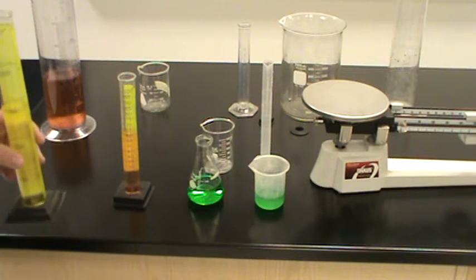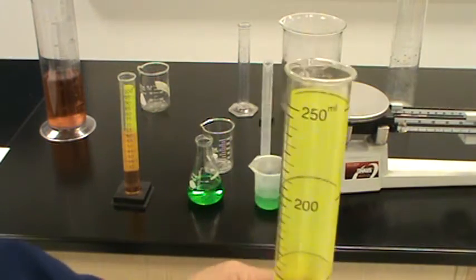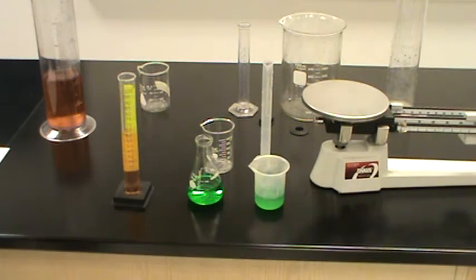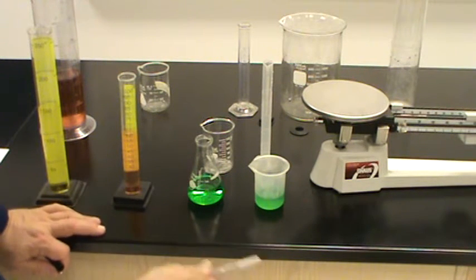All right, so number 1, we want to know what size of a container is this? Well, the largest number is 250 milliliters. So this is obviously a 250 milliliter container. And please make sure you're using the right units. For our second one, the number at the top is 100. It's a 100 milliliter container.